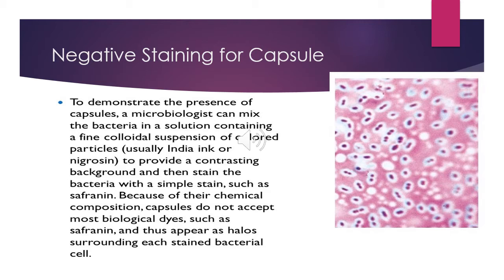And then you stain the bacteria using safranin. The chemical composition of the capsule does not accept most biological dyes. Hence, they appear as clear halos surrounding each stained bacterial cell.